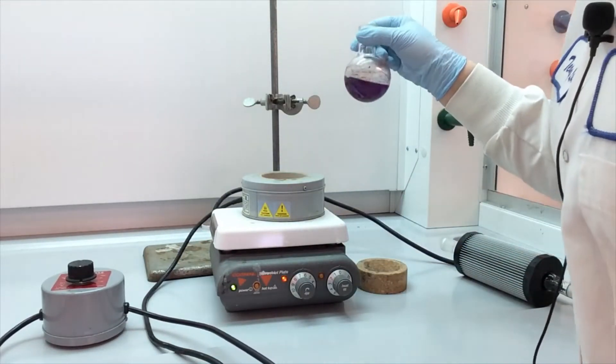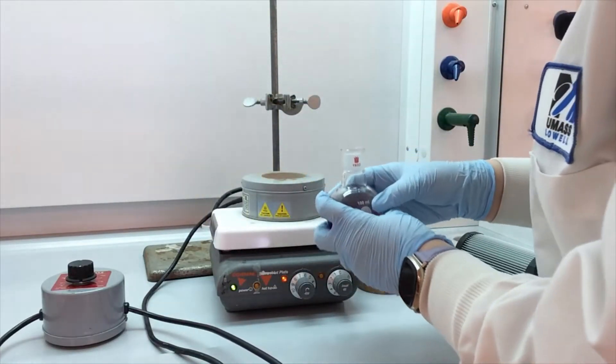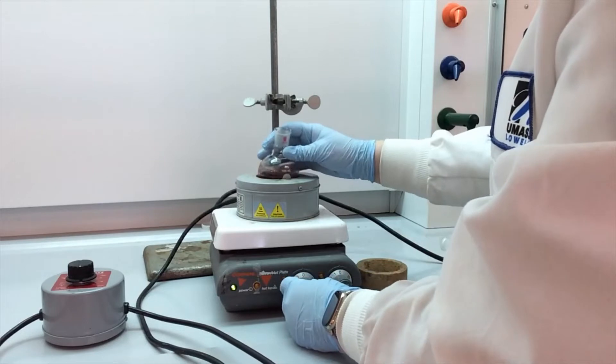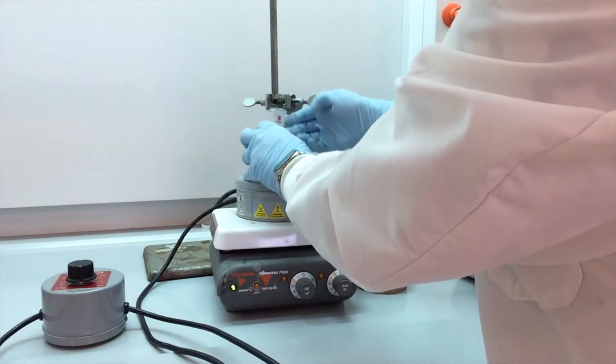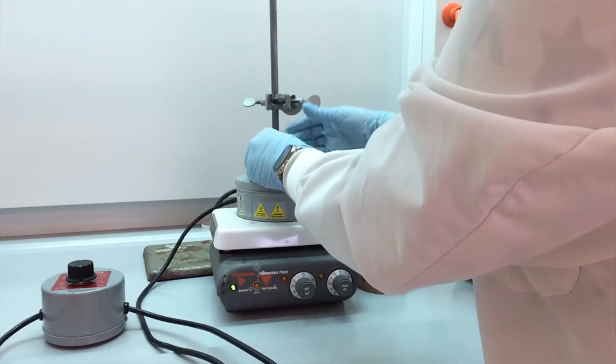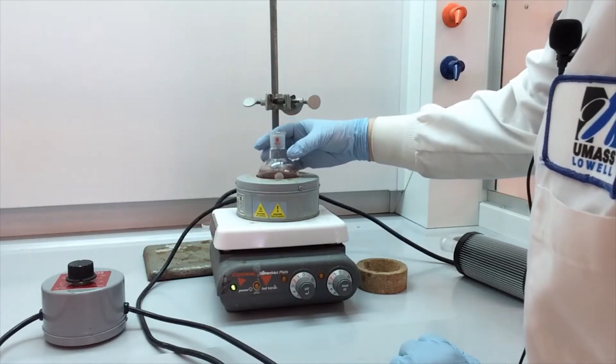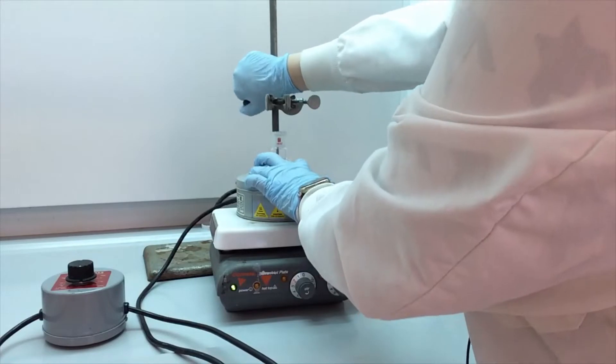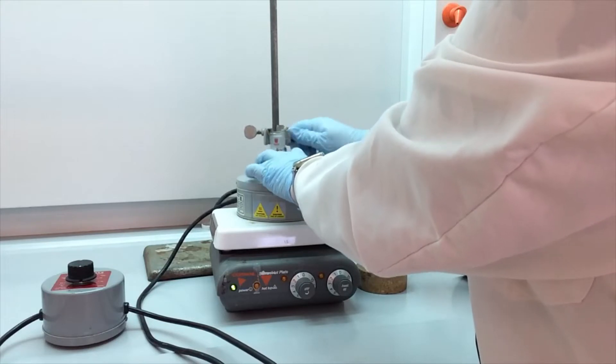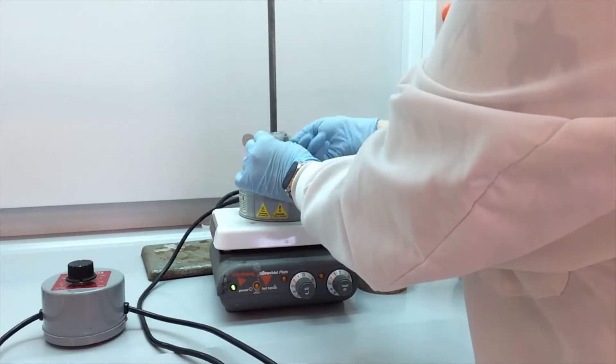So we have our reaction with our solvent. There's also a stir bar in here. So now what we want to do is set this in the mantle. So it definitely fits. And we want to clamp it right here on the ground glass joint. So that's the strongest part of the glassware. I'm going to lower my clamp and make sure that it's clamped very tightly.